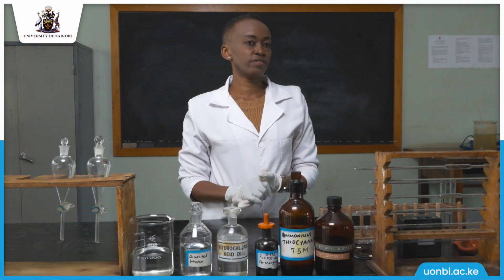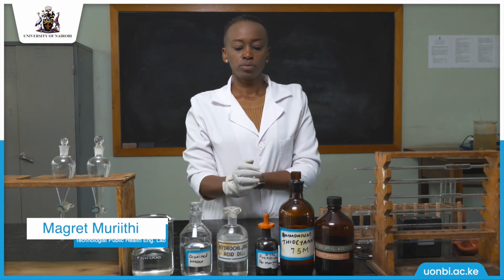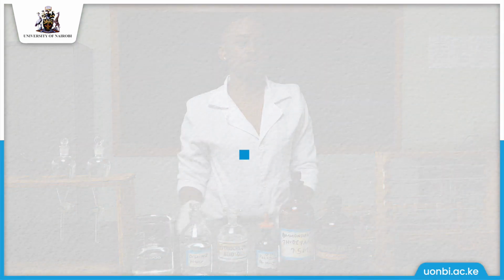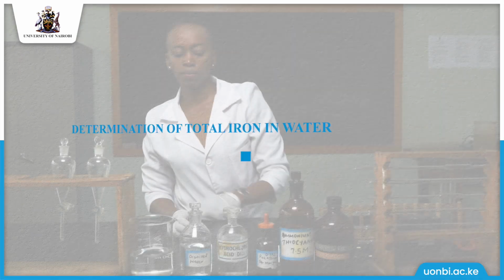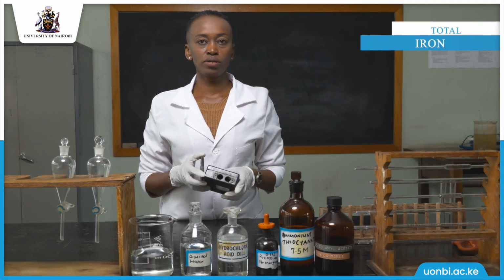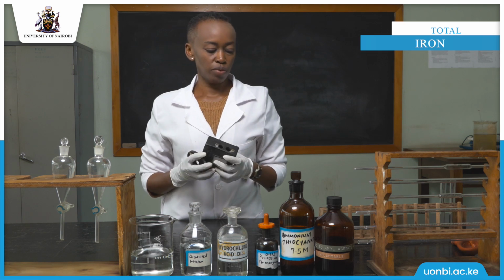This is the Public Health Engineering Lab in the Civil Engineering Department. Today we are going to conduct determination of iron in a water sample. This is our water sample. We are going to use a colorimetric analytical method by use of a Lovibond.